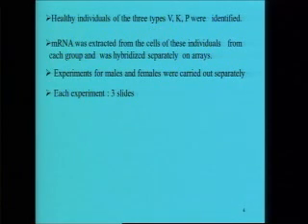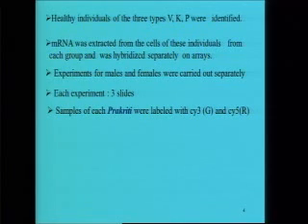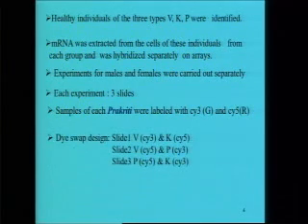Each experiment consisted of three slides. And it being two-channel microarray data, two types of samples were simultaneously hybridized on the array. And to distinguish the samples, we used reporter molecules. The two reporter molecules used were Cy3, which shows green color after excitation by the laser beam, and the other was Cy5, which shows red color when the slide is excited by the laser beam. The design used was the dye-swap design. So what is this dye-swap design?